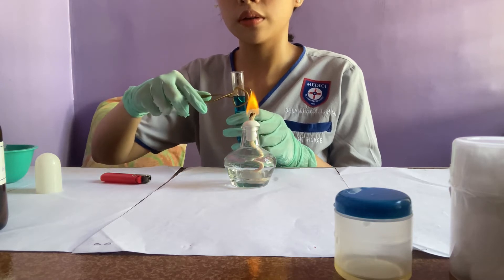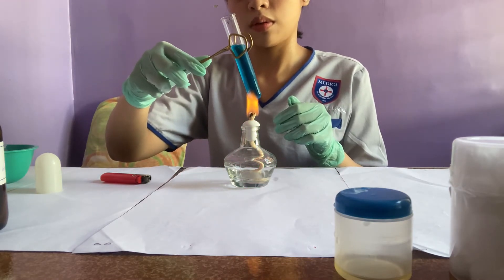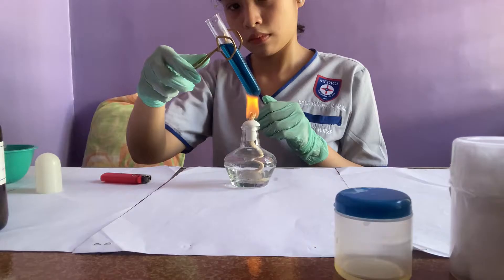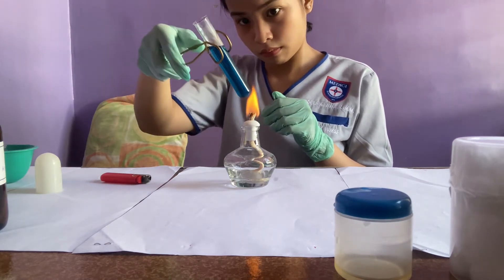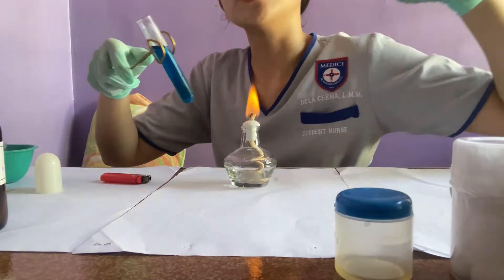So the Benedict's solution we took earlier, we're going to bring it to a boil. The angle of the test tube should be slightly slanted. Remove it from the fire occasionally because it really boils vigorously — you'll feel it, like it's about to burst.